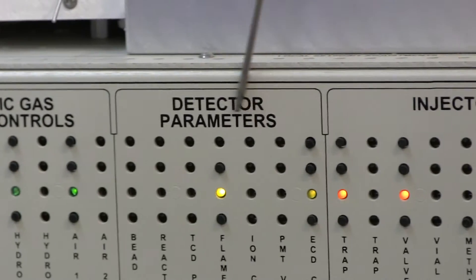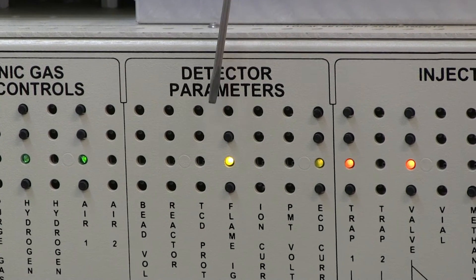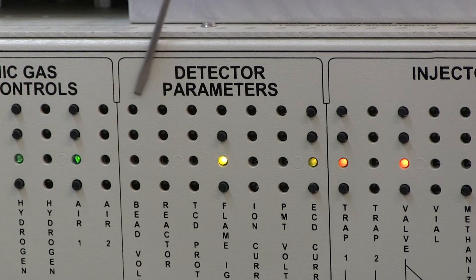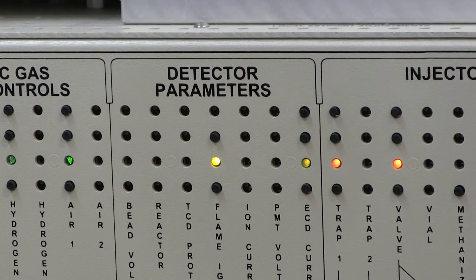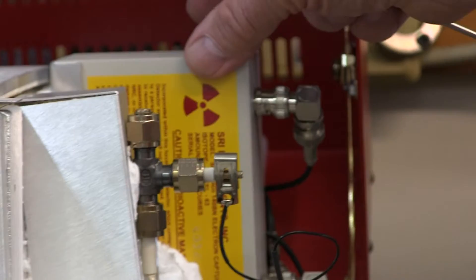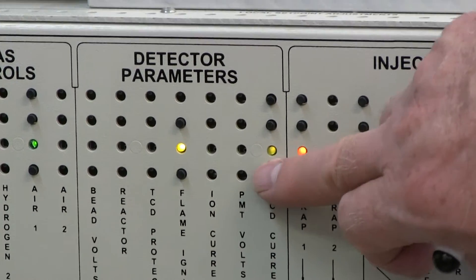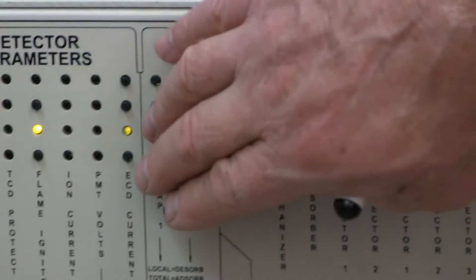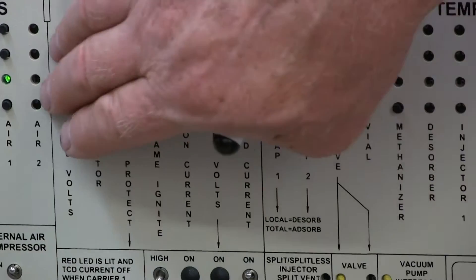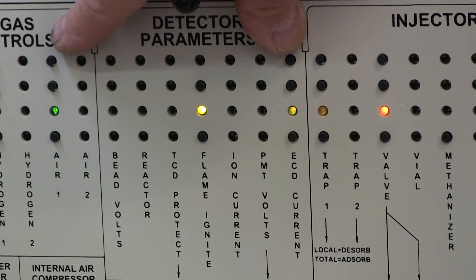Then we have a section here called detector parameters. Depending on which detectors you have, there may be buttons if that detector is installed, or there may not be. This particular GC is equipped with an FID detector and an electron capture detector. These two buttons control the igniter voltage for the FID detector. These three buttons control the current for the electron capture detector. We make 16 kinds of detectors, so there will always be some kind of detector parameter control in this area.